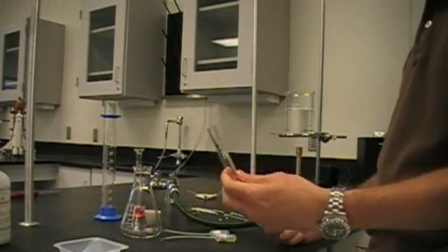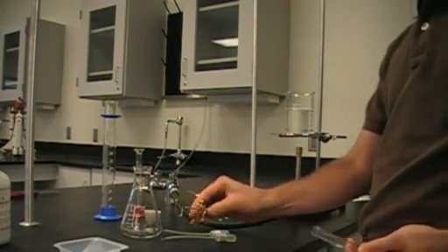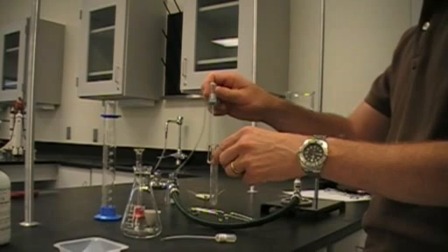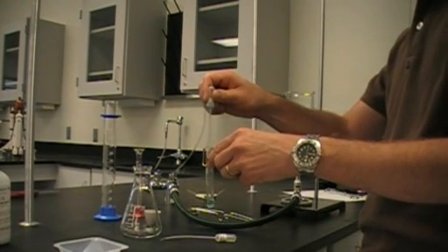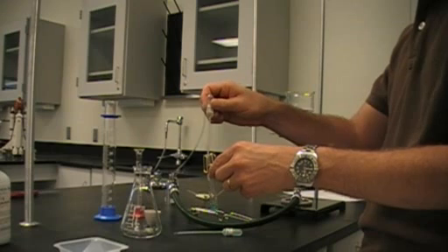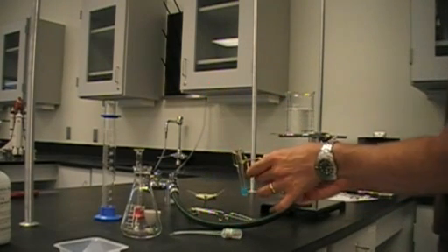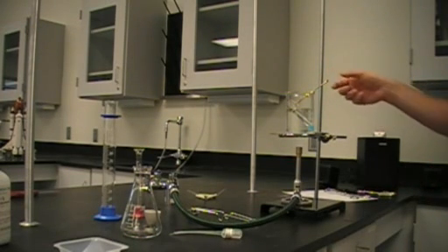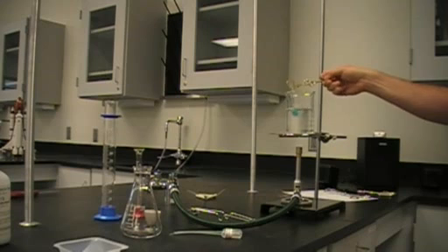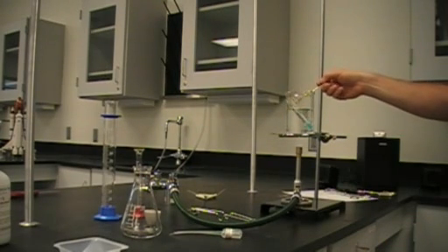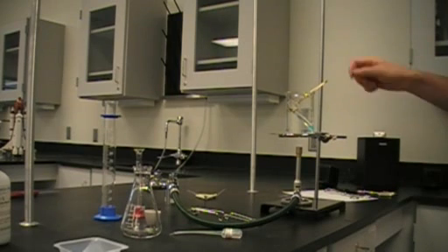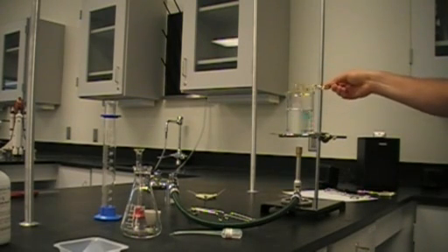Our next thing, we have looked at a test tube already. Here is a test tube. This is a test tube holder. You can just simply squeeze the sides and put your test tube within it. In this case, I am going to mix a couple of chemicals. They happen to be on pipettes this time. And we are going to add them together and then stick them in the water to see what happens when they are heated. Again, this will be a lab you do a little bit later in the year. We simply put them in here and kind of just let it heat. You can kind of stir it a little bit if you would like. But really, our glass is hot and our beaker. Our water is not quite boiling yet, but fairly warm. And we just want to heat what is in the test tube very gently. So, we are just kind of putting it in the warm water and seeing what happens when we mix these two chemicals.